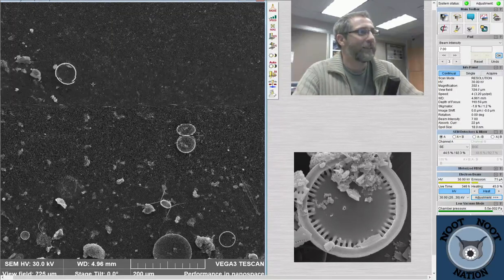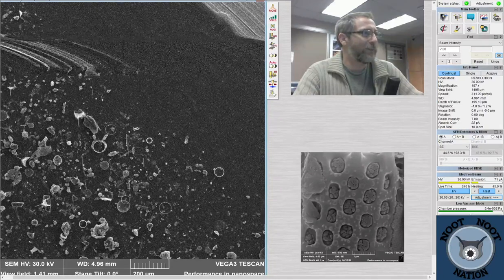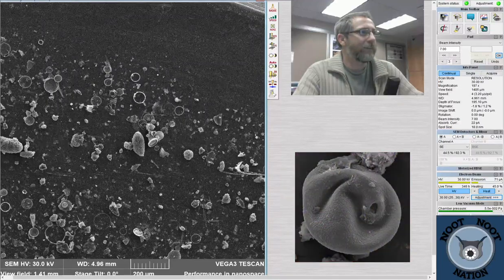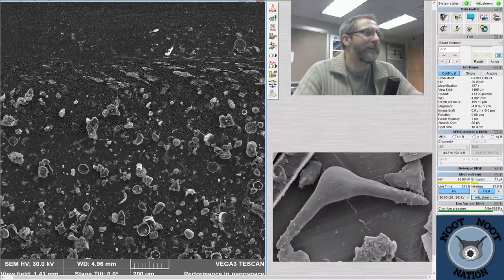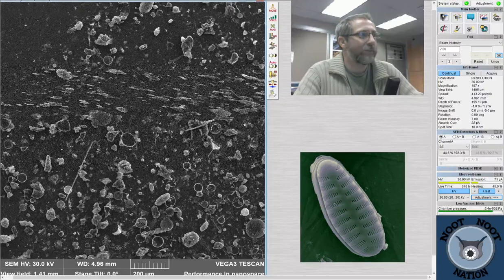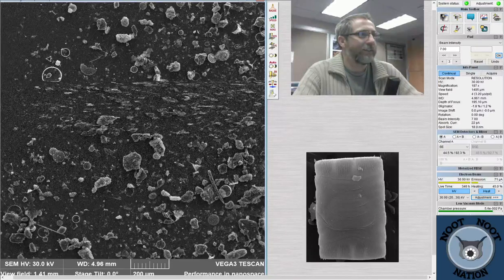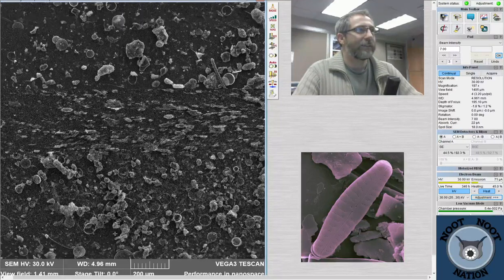So, let's see. If I zoom out really far, why don't we just do a quick scan around and see if I see any more of those big things that are kind of cool in here. And then I'm going to move over to one of these other samples. All the samples are from the same material, unless we wanted to go look at some of the East African stuff, but they're not all the same density. So I just put a drop on each one, but a drop is pretty variable with respect to what gets on the slide. And I should try to get some nice image of a Chaetoceros, since there's a bunch of them in these samples while we're here. Scrolling around, there's a big sponge spicule up there.